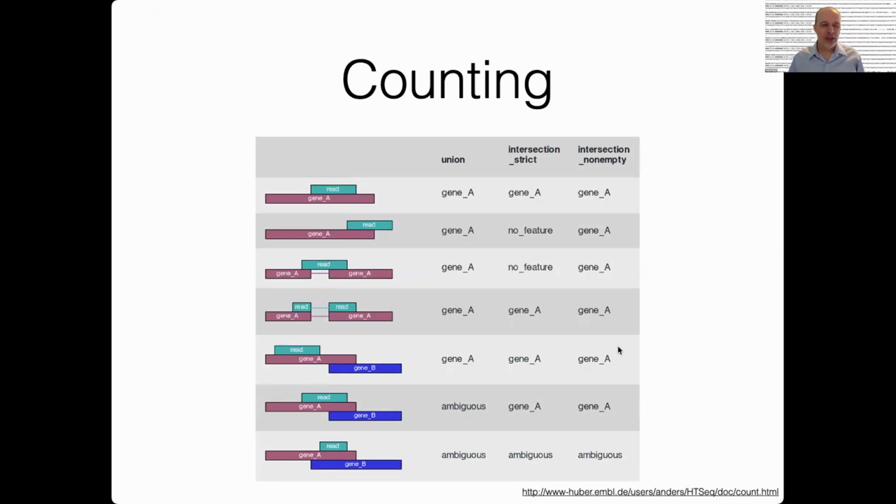I'm not going to get too much into detail of this, and you don't need to worry too much about it, but in the back of your head, you can think about the fact that this is kind of the ideal case where here's the gene, and the read is landing somewhere inside the gene. There are different pathological cases that are not what you'd expect, where a read is partially on a gene, partially not.